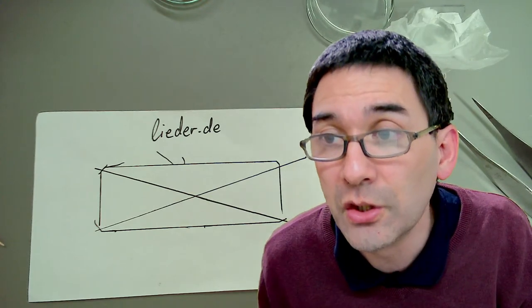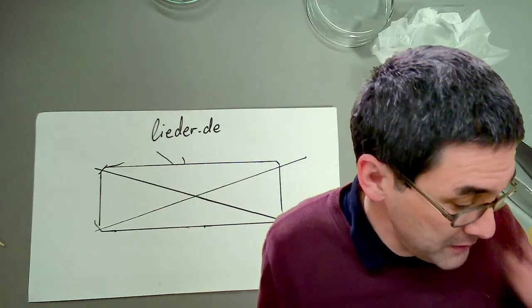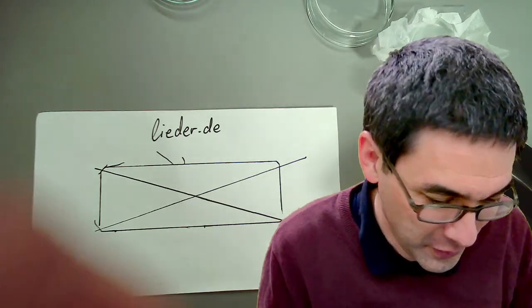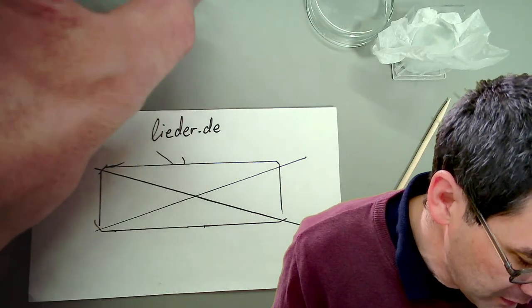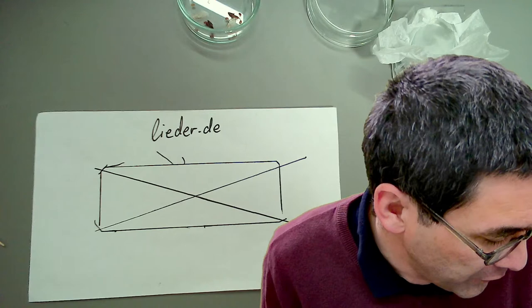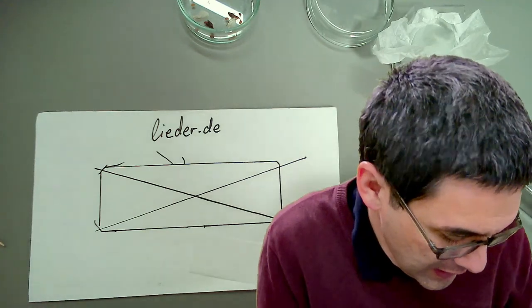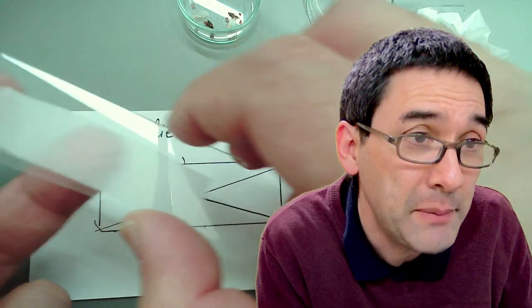Okay, I want to make a few more specimens because I actually only made three up to now. I prepared so many more, and I thought, oh my gosh, do I have enough things to mount? I'm going to try a wing now. There were also a couple of wings in there that the bees lost. Let's make a wing. By the way, did you see that? The slides are all separated by a piece of paper.